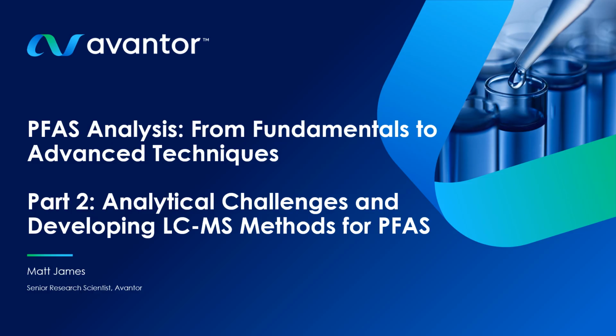Thank you for the introduction, Alex. Welcome everyone, and welcome back to those of you who joined us for part 1. In this series, we're going to focus on the LC-MS analysis of PFAS, and the aim is to really share some of the thought processes and experience that we've gained in our application lab when developing various methods for the analysis of PFAS.